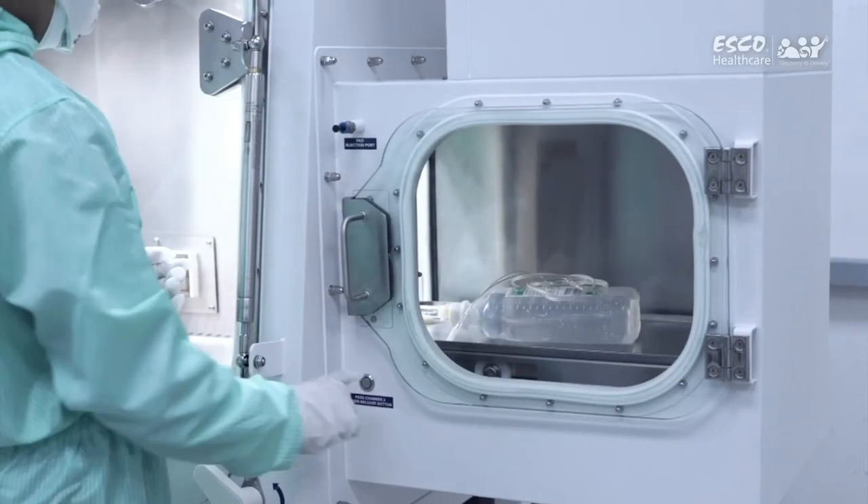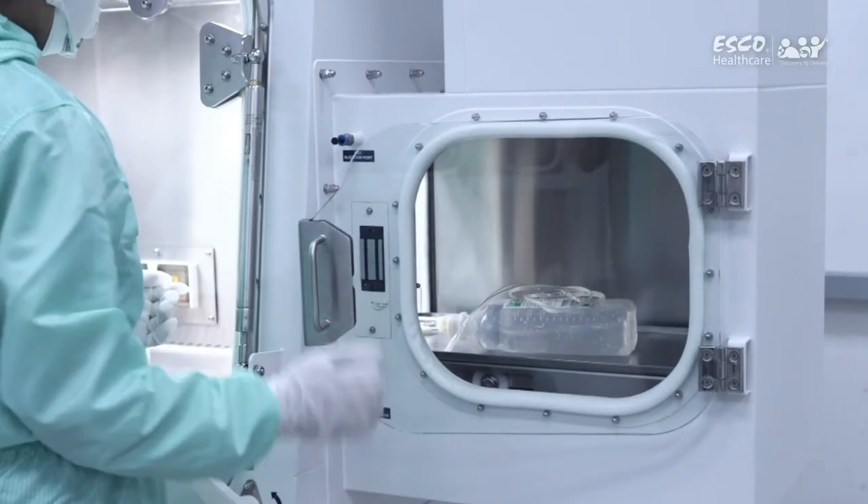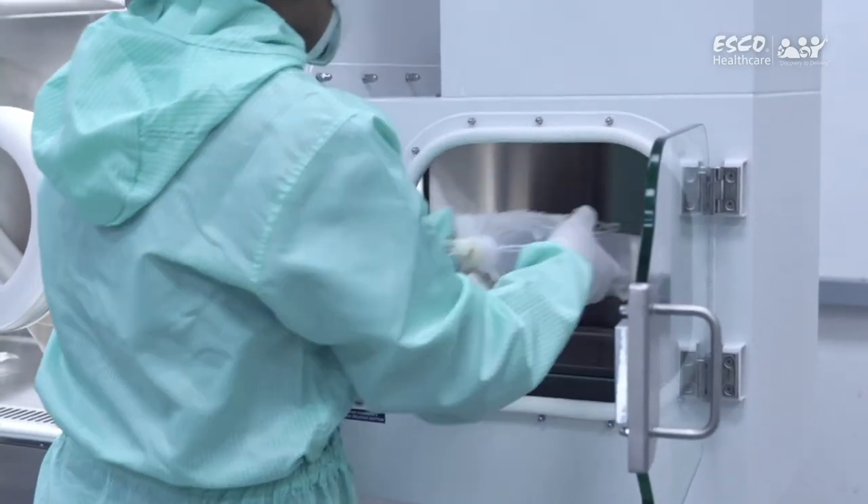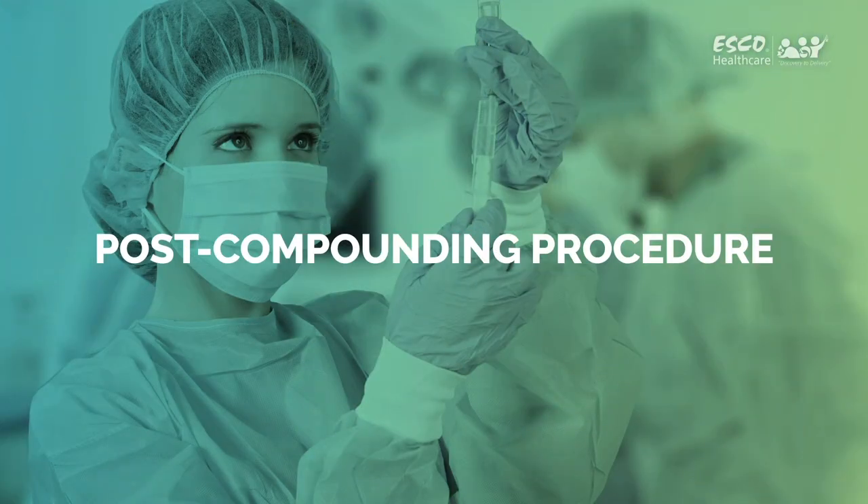Remove your finished products by pressing on the outer door button. After the compounding procedure, thoroughly clean and surface disinfect the area again prior to proceeding to the next batch or before turning it off.